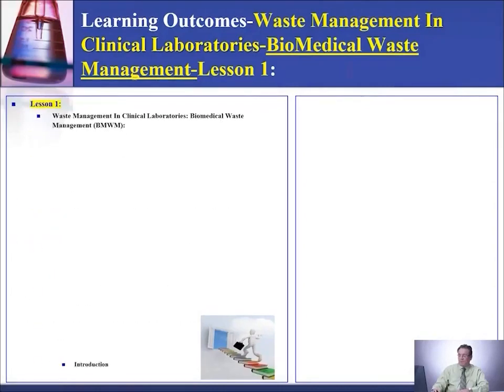In Lesson 1, we'll talk about an introduction. We'll give you an introduction to the topic. Then we'll cover biomedical waste classification. Then the magnitude of the BMW. Who generates BMW, biomedical waste?